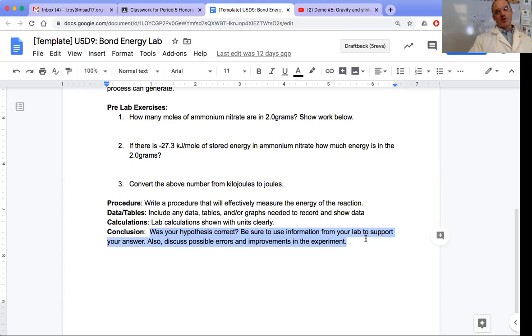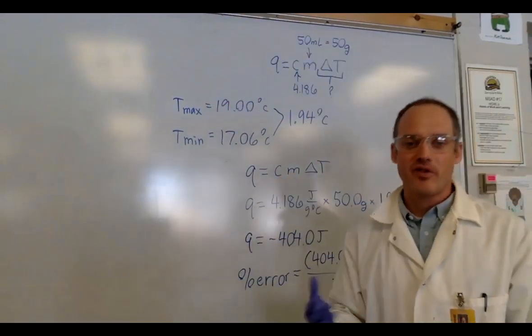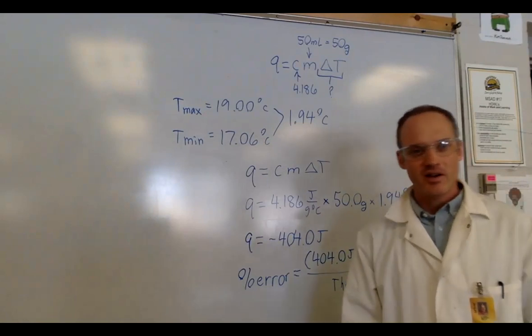I did it pretty quickly and in one trial. It could be pretty easy to do this over again as a second trial to make it a little more accurate. Knowing the data that we have and the error that we have, there might be something we could tweak in the experiment to make it work.